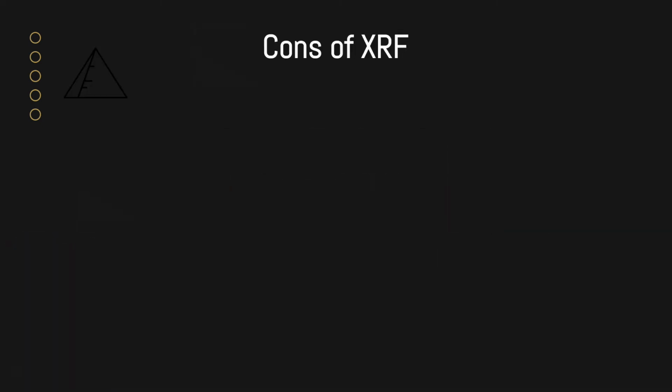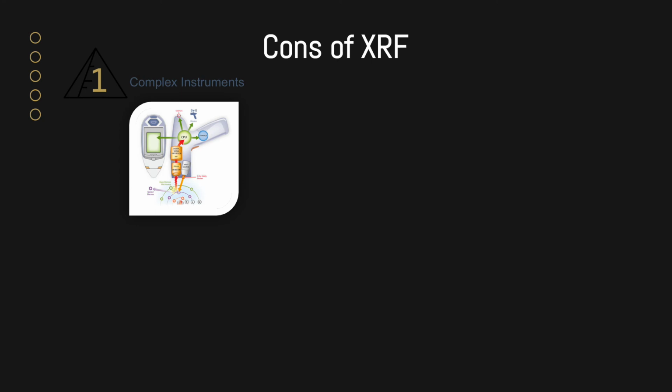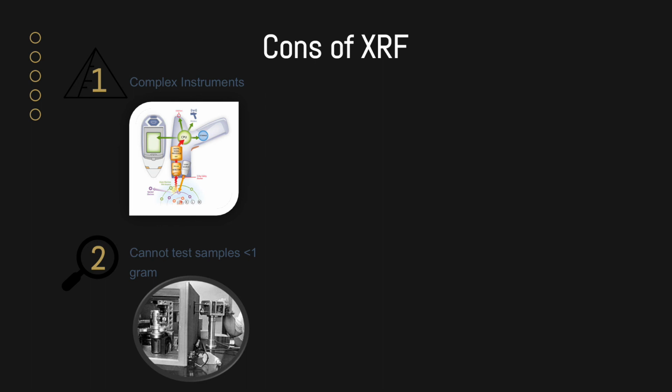Cons of XRF. 1. This technology requires complex instruments to aid in detection of tested samples. Because of this, X-ray fluorescence is known to decrease efficiency present in photon excitation. 2. XRF technology cannot test samples less than 1 gram.